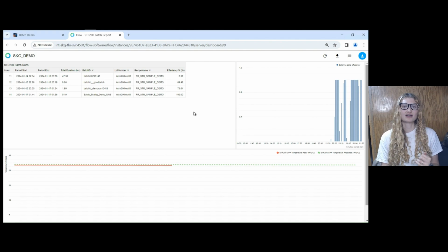And don't get me wrong, I'm not hating on digital batch reports. In fact, this 4.0 plant still has them. I showed you the Sephisoft batch module because they are a requirement for life sciences. They provide that FDA mandated traceability. But let's be honest, it is hard to quickly glean information from them. They are great if you can pinpoint where to look, but absolutely terrible as a starting point.